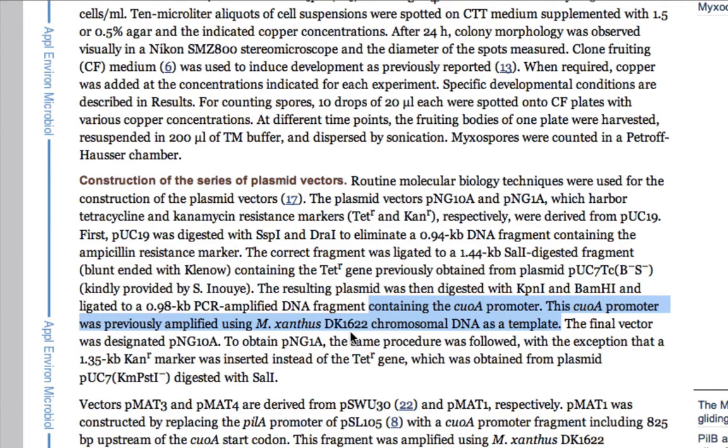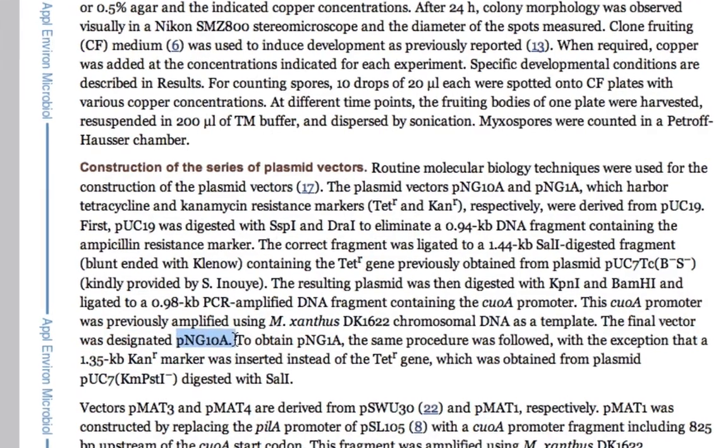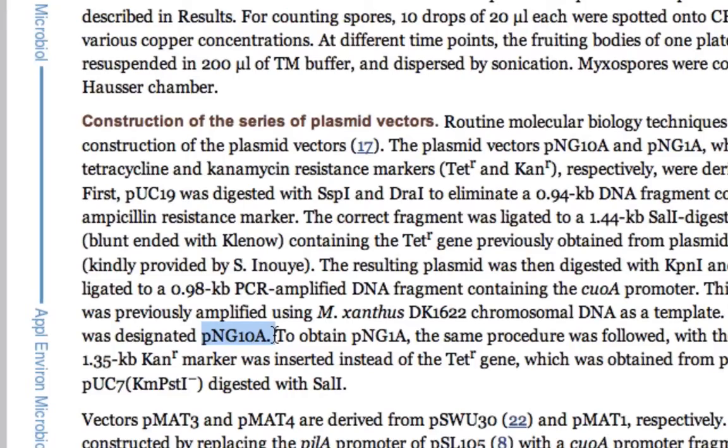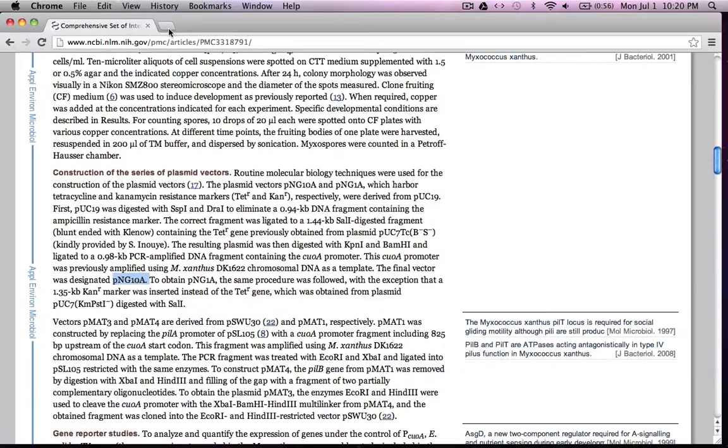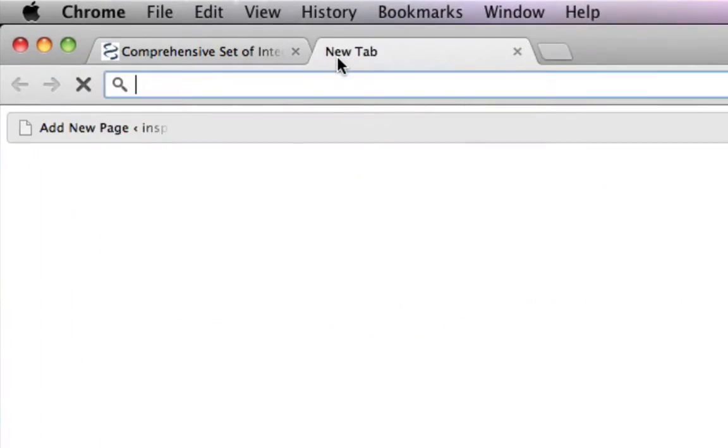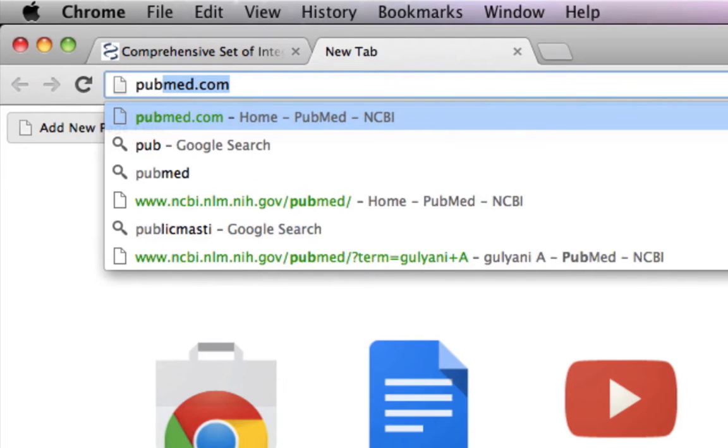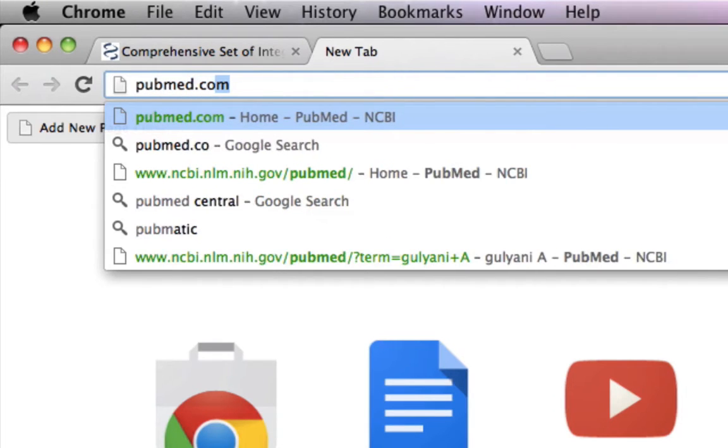The final vector is called PNG10A. So basically you are interested in getting the entire sequence of PNG10A and opening it in your Serial Cloner software. You open the NCBI website.